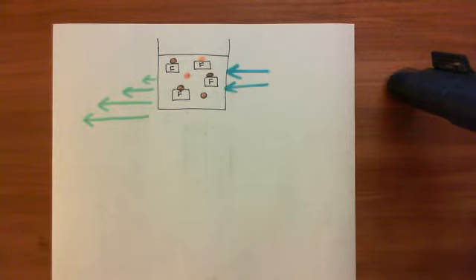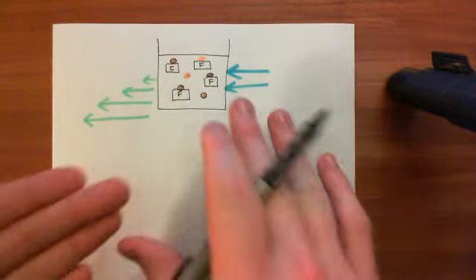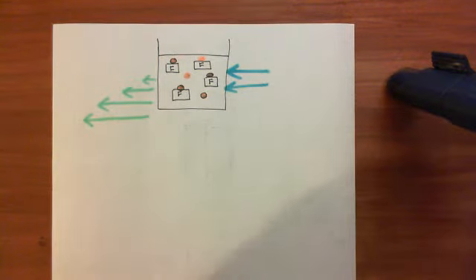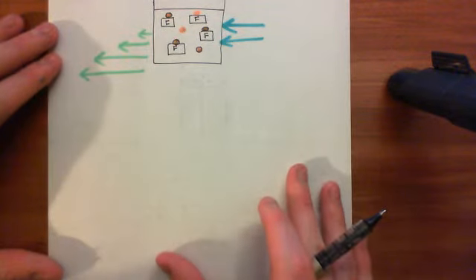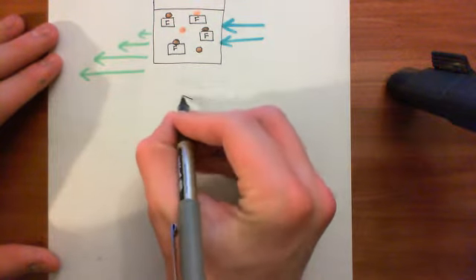Okay, right, but before we discuss how to actually work out what a change in the fluorescent signal means with regards to calcium concentration, I firstly want to take this back onto the level of cells, because at the moment we're just dealing with solutions in flasks. I want to take this into cells. How are we going to get this dye molecule into cells? Well, that actually does present more of a problem than you would think.